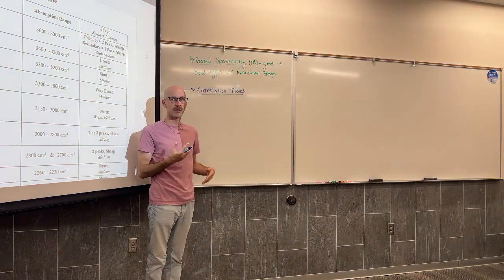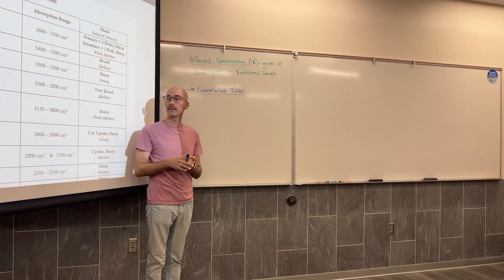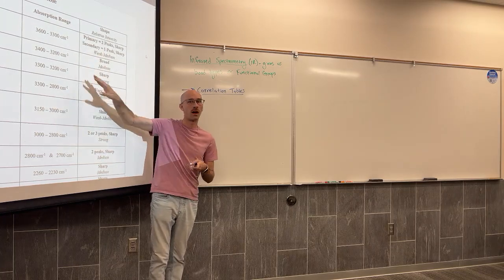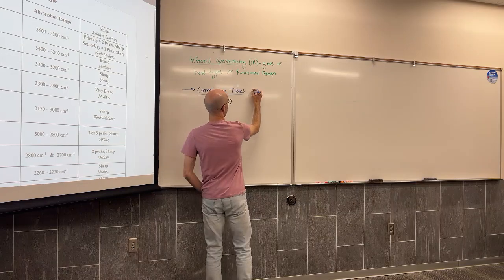Not to be redundant, but correlation tables correlate bond types to a signal on the IR spectrum.